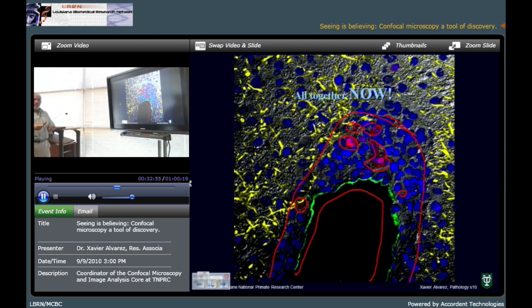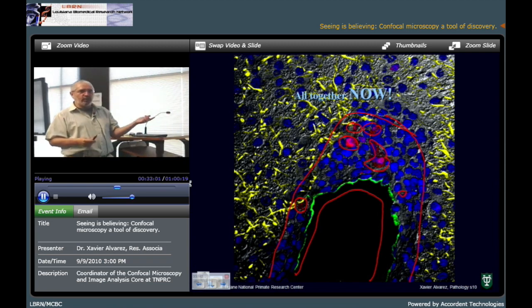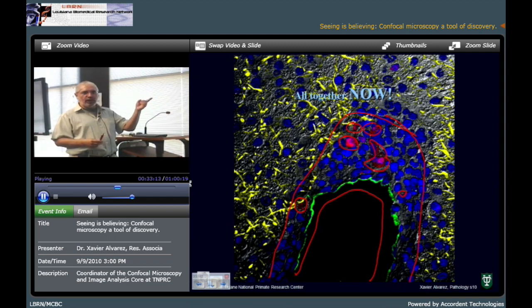Okay, that tells you a lot, and now you can start asking what kind of cells those are. We have been doing that, and those are macrophages of a certain lineage, mature macrophages. The young macrophages, or a different lineage, don't stain for that. Okay, then there are lots of things to do.